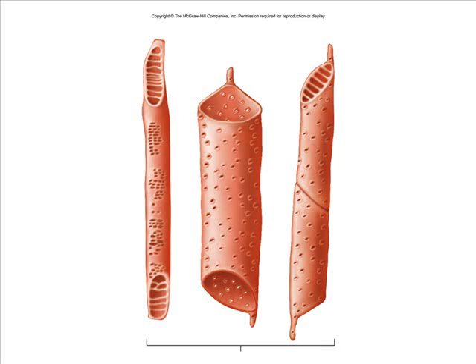One might be vessels. Those are hollow pipes. Vessel members, actually, are the individual cells. Are these secondary xylem cells alive or dead at maturity? They are dead at maturity. And so they're connected end to end like pipe sections, and usually fairly large in diameter. As we look back at this, it's pretty easy to pick out the vessels. Those are the big guys. The really big ones are for sure vessels.